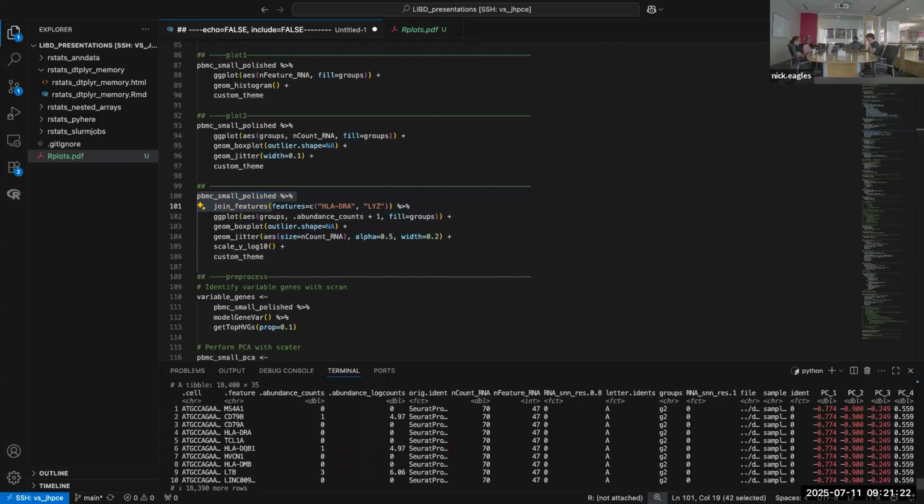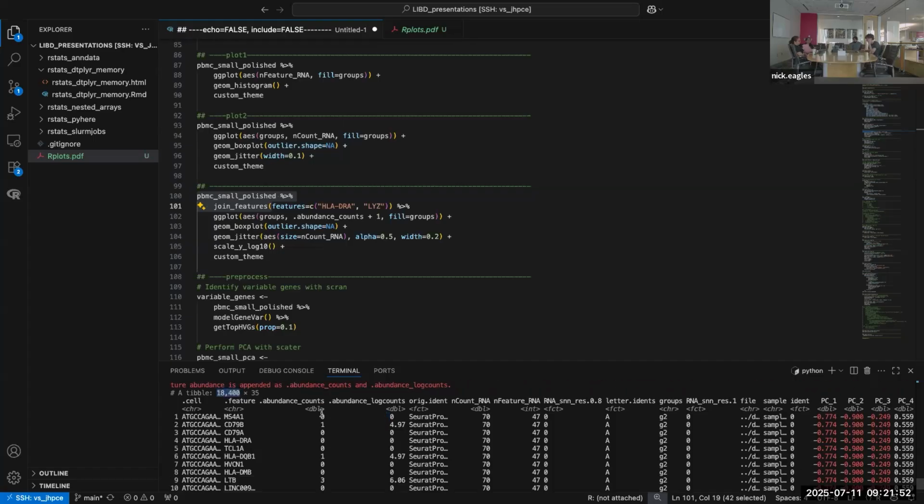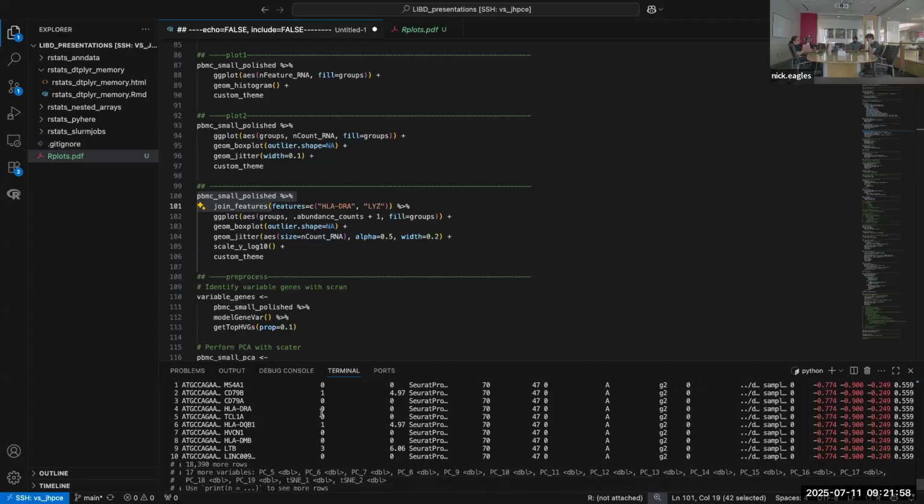So this essentially is most of a summarized experiment object as a tibble, because it has every cell and gene combination followed by the counts. In practice, this would be an absolutely gigantic tibble, and just for memory reasons, this would not be an efficient thing to do in a real data set. I mean, this is real, but it's a very small subset. If you would multiply the actual rows by the columns in a real object, it would be way too big. But that is an option to print all your genes here.